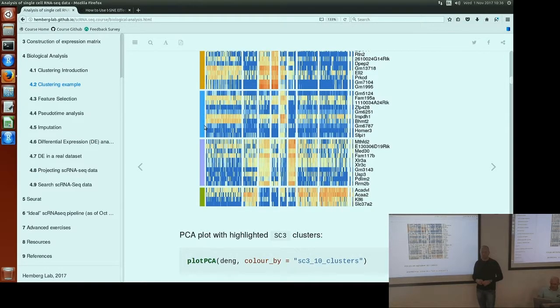So the question is where to put these gene names in your original data set object. In SC3 there has to be a column in the row data, which is related to genes. It's the rowData slot of the SingleCellExperiment object, and the name of the column has to be feature_symbol or feature symbols. So it's documented in the SC3 documentation.